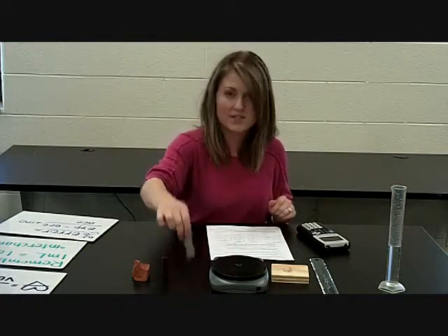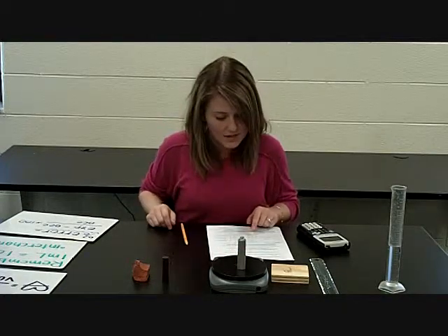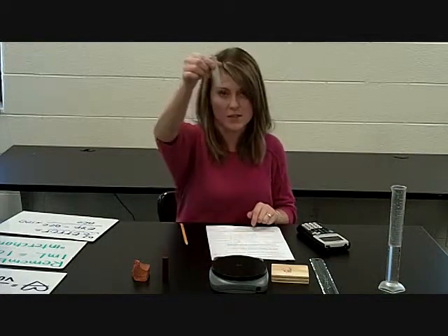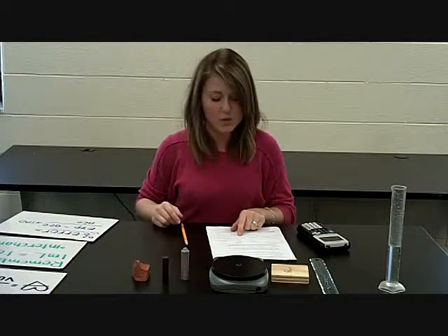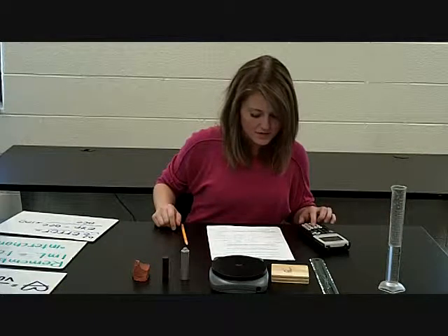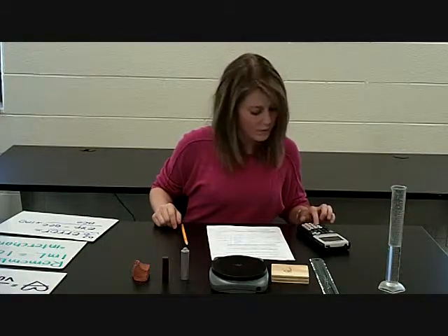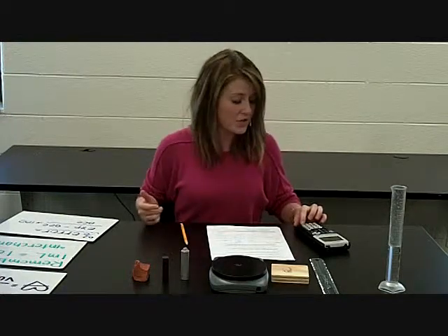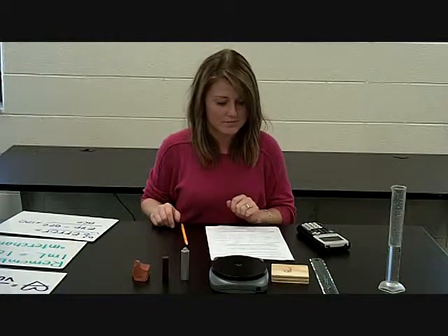Next up is our metal cylinder, so let's go ahead and get the mass of that. It shows 55.8 grams as the mass of this metal cylinder. The volume we used in the last video was 20.1 milliliters. So again, we're taking our mass, which is 55.8 grams, you're dividing by the volume, 20.1 milliliters or centimeters cubed, either one, and you get 2.78 grams per centimeter cubed.